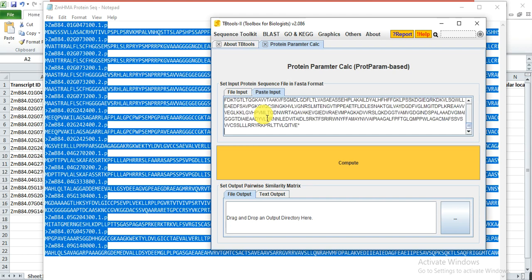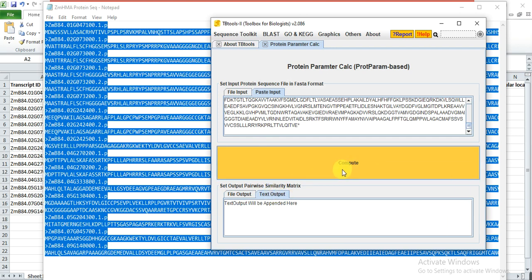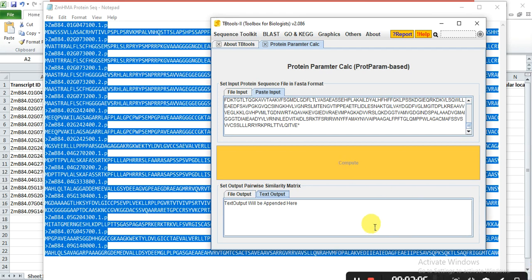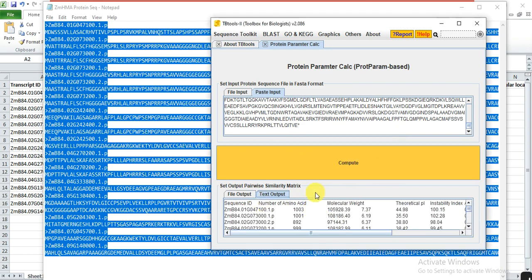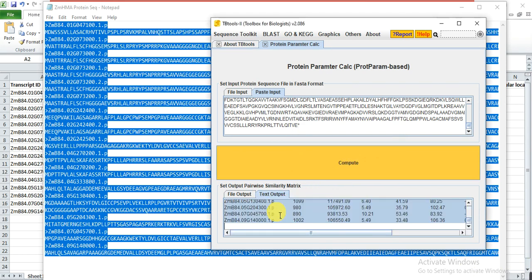Paste your sequence here, click on Text Output, and click Compute. It will start the complete calculation of your parameters and will take some time. When the analysis is completed it will give you a message saying 'Compute Finish.' Click OK.